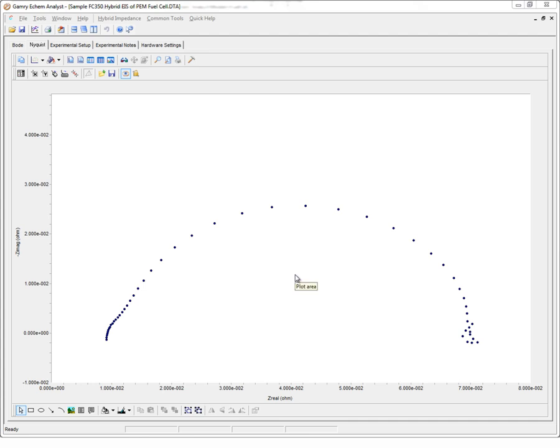Hello, this is Chris Beasley, and I'm going to describe Gamry's new Autofit routine for electrochemical impedance spectroscopy data.